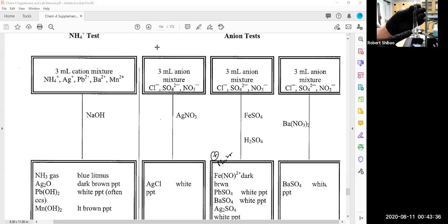Okay, now I have the iron 2, and I could add more iron 2 to this because I already precipitated it out, I think. I think I pretty much precipitated it out. Let's see if I get more precipitate. No. I pretty much precipitated out all the stuff. And so I added more iron 2 sulfate. I didn't get any more precipitate. You see that? But I need a lot of iron 2. It makes the test a little bit more sensitive.